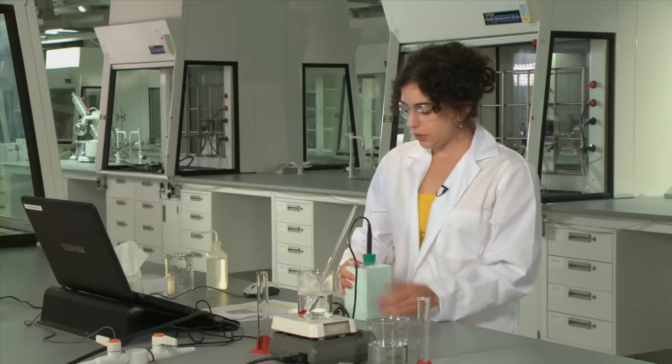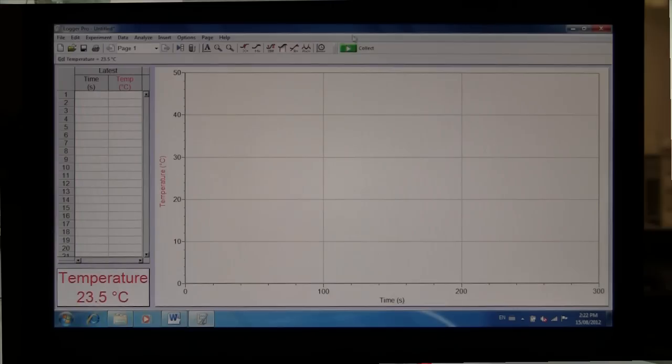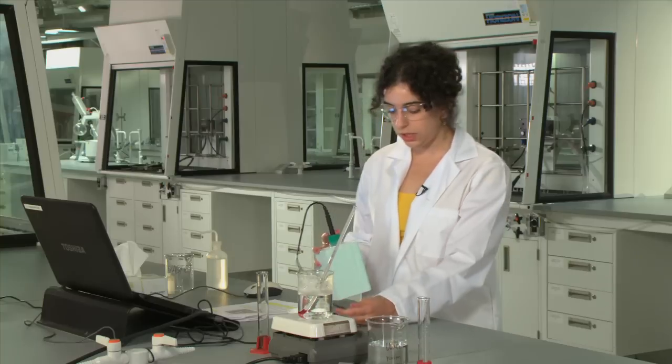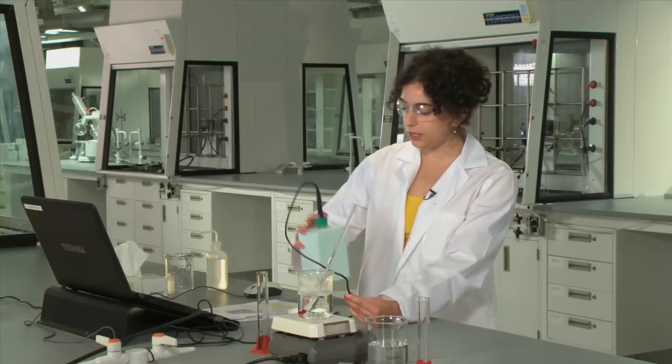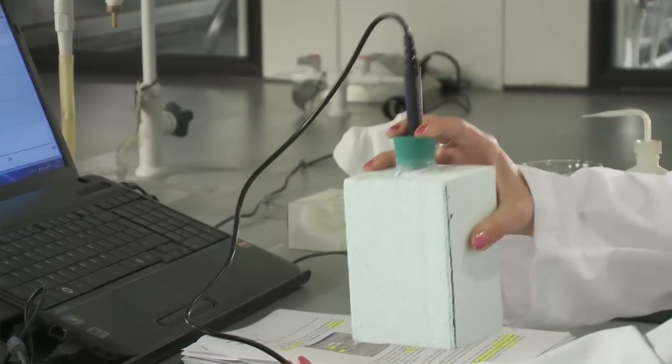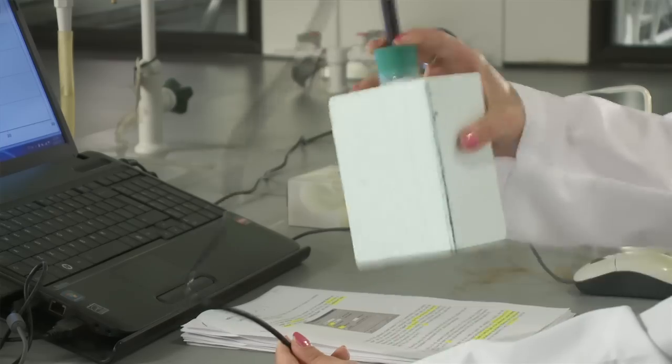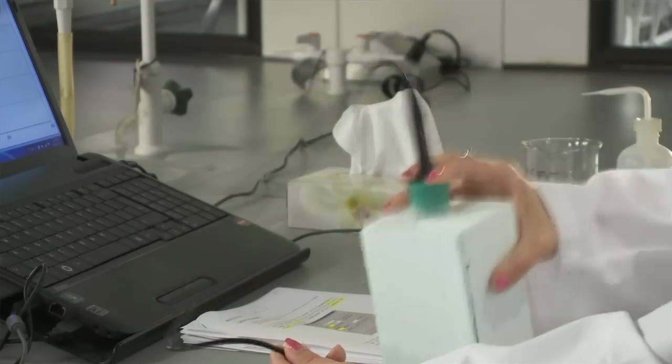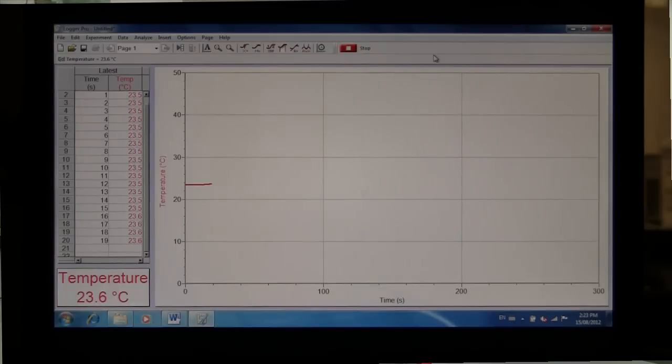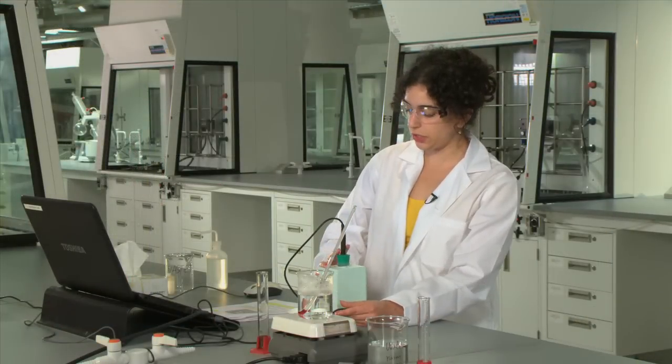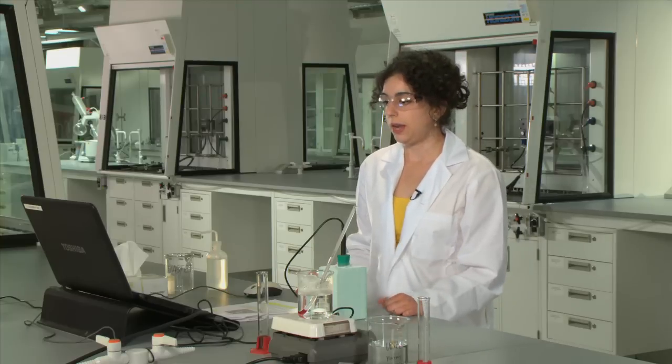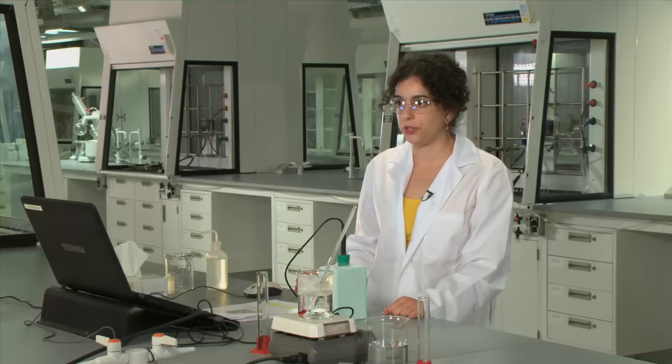So then you're going to click collect on your Logger Pro software and you're going to shake the calorimeter. When you shake it hold the cable with one hand and hold the calorimeter like so with the other hand just to keep it stable and then you're going to shake up and down for 60 seconds. And you'll see on the Logger Pro software that it'll keep count of the time and the temperature. When you get to about 60 seconds you'll just set the calorimeter down on the bench and let it sit for about another 100 seconds to allow the temperature to equilibrate.